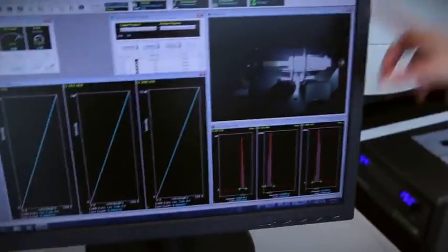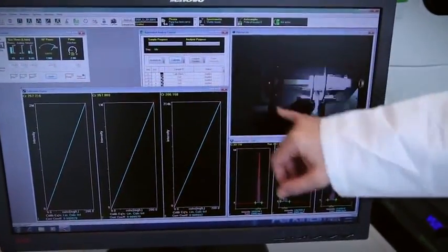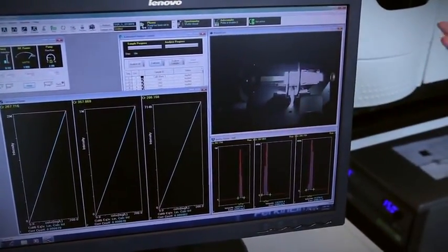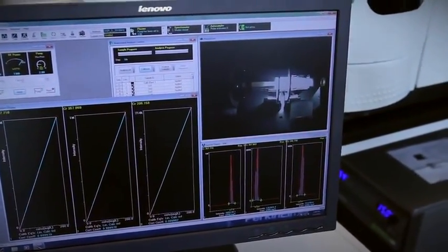And what's really cool is that sample then goes inside this machine and this bright image here is actually a plasma. That plasma is made with argon gas and it can reach temperatures as high as 10,000 degrees Celsius. What that's going to do is atomize everything. It's going to put them into highly excited states, all of these atoms, and all the liquid is going to go away. And those atoms are going to eventually drop back down to what's called their ground state and emit light. And that light is going to be a different wavelength depending on the atom.